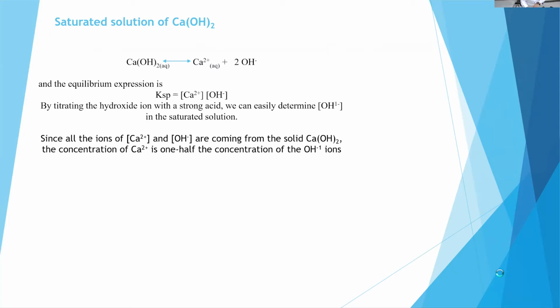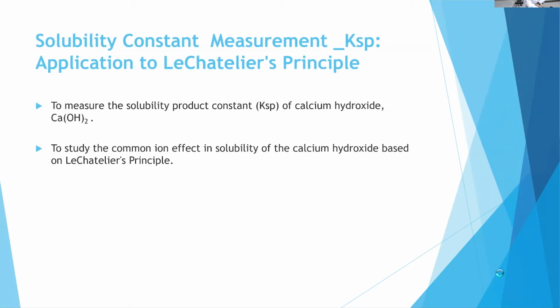constant, or KSP, for calcium hydroxide using titration. And also we want to study the effect of a common ion on the solubility of calcium hydroxide using Le Chatelier's principle.